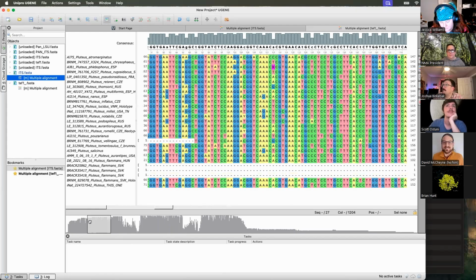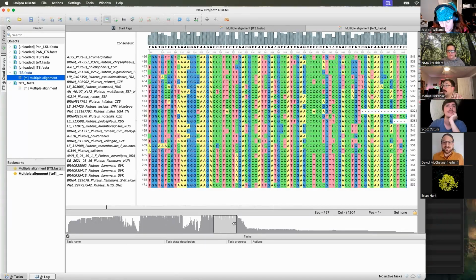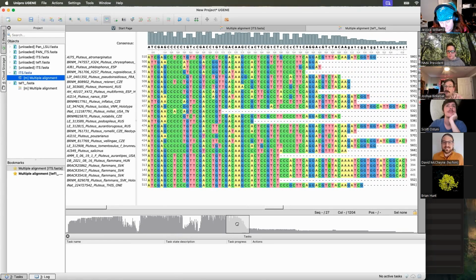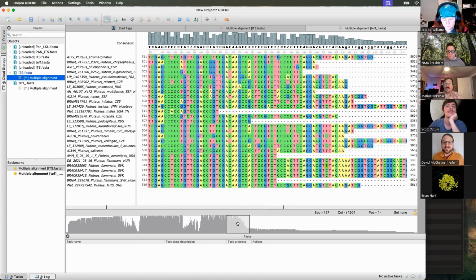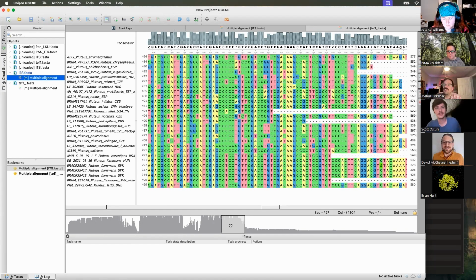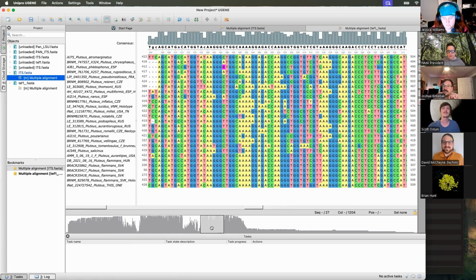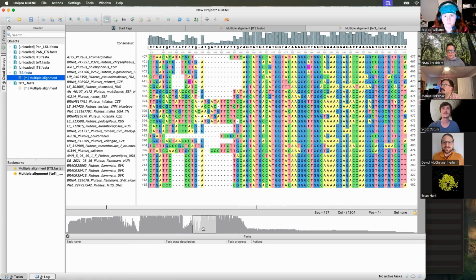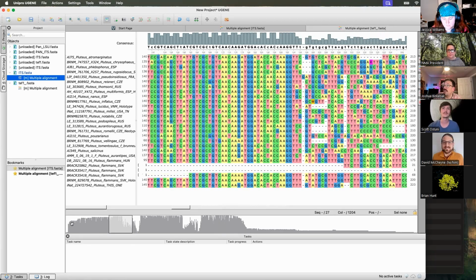If you do have gaps in the protein coding region, they should be in triplets, right? Because sometimes they lose whole codons, but if you have a single nucleotide indel frame shift, you're going to completely mess up your protein. So you will see gaps sometimes, but they'll almost always be in sets of 3. It's a good way to spot check and make sure things don't get crazy, except for your intron regions, where you kind of expect to have these junky regions.